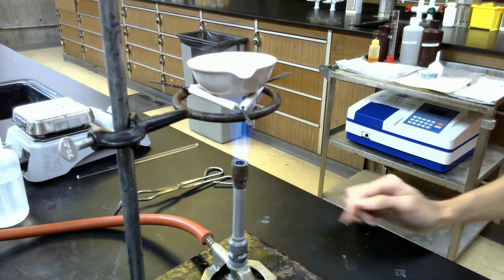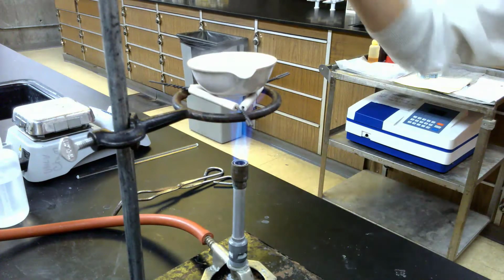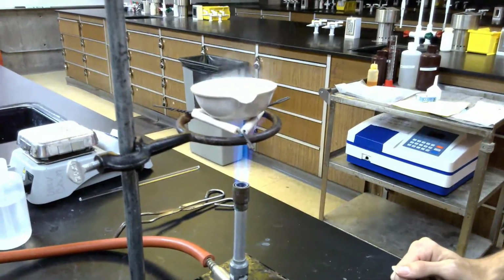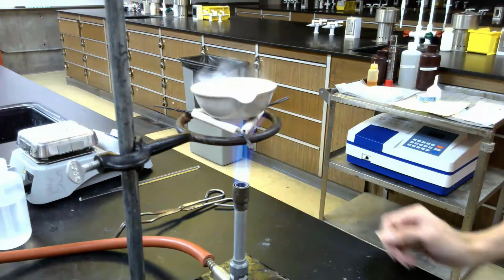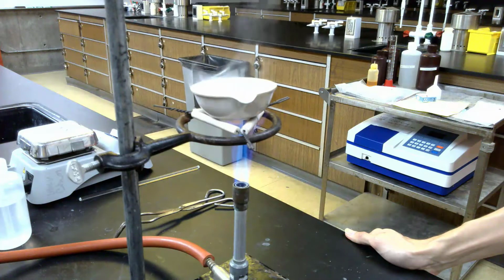Now you can already see the evolution of the ammonium chloride gas. You can see this white gas being emitted from the evaporating dish. That's the ammonium chloride subliming. And so what I'm going to do is heat this until the gas evolution basically stops. And then I'm going to heat it for about 30 seconds after that, just to make sure I've driven all of it off.